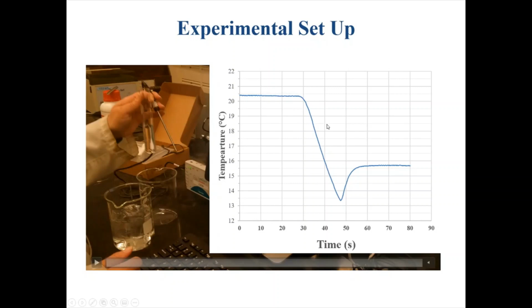So on the right here, what I have is the cooling curve graph that we actually are going to measure on the vernier. So there's a computer screen here, but I'm going to show you what was on the computer screen. And then over here we have one of our lab technicians who kindly stayed behind to create this video for us. So she has her 10 mils of the acetic acid in her test tube. She has the vernier probe here, and she has her ice bath here.